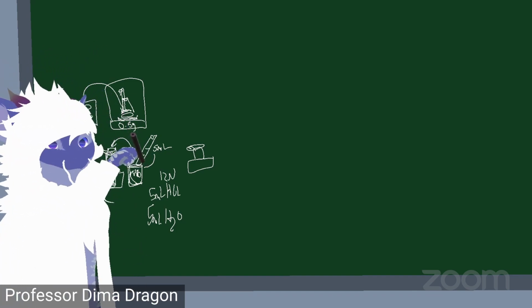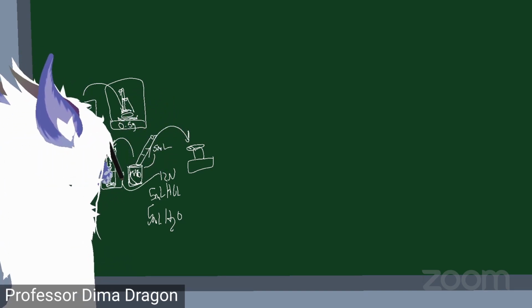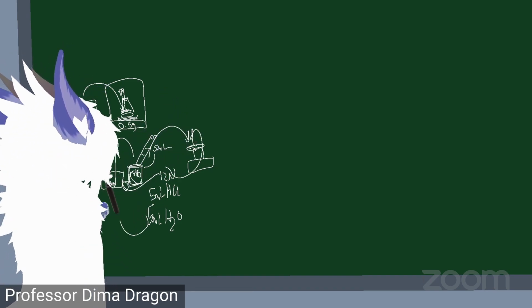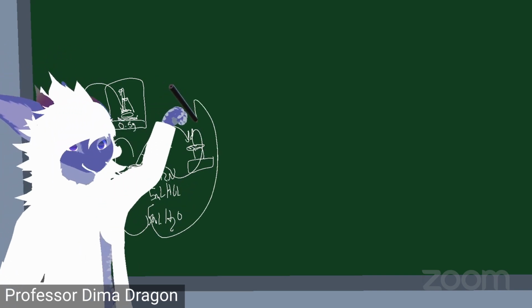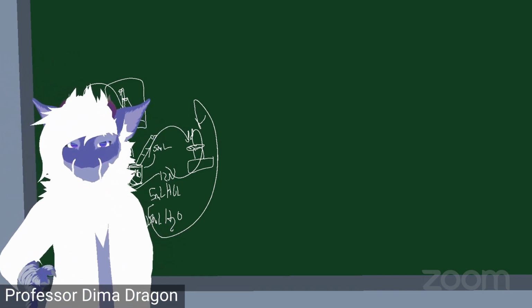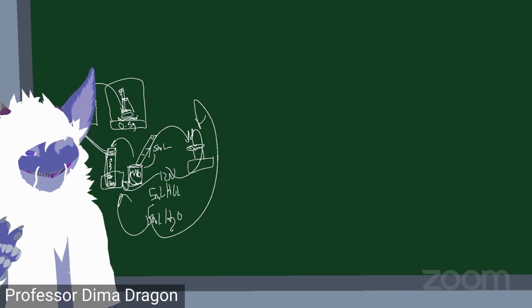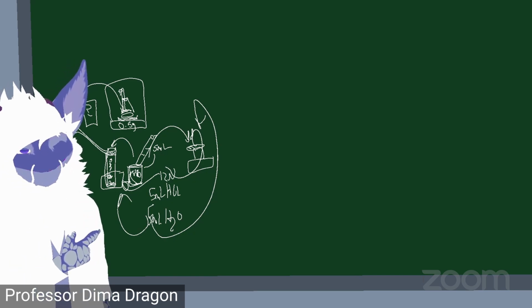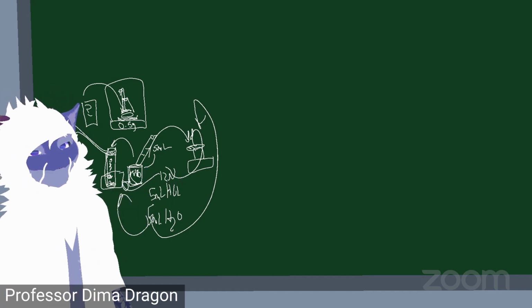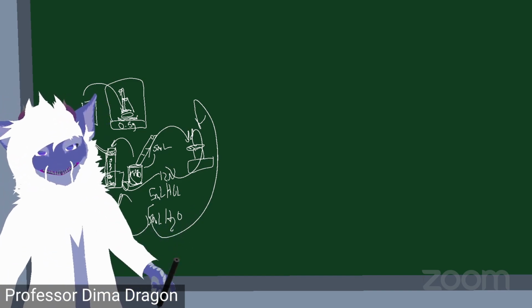So you add in this internal standard, you vortex it. You add in the acid, you vortex it. You add in the water, you vortex it. All right? I want to make that clear, guys, because the things that will make you lose points on this assignment is not doing this correctly. So make sure you're vortexing it correctly. What you're going to be using for the acid is just a pump. You're just going to go up and then down. It's really not going to be that difficult. Water, same thing.